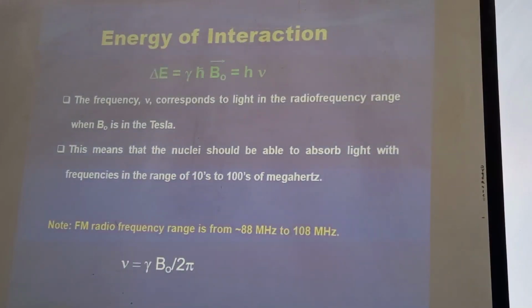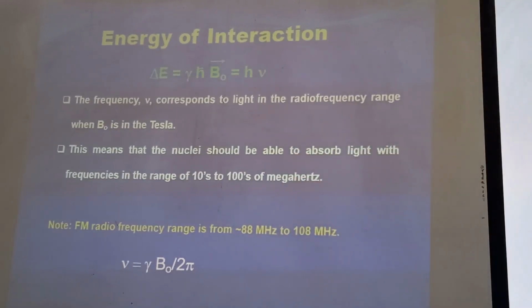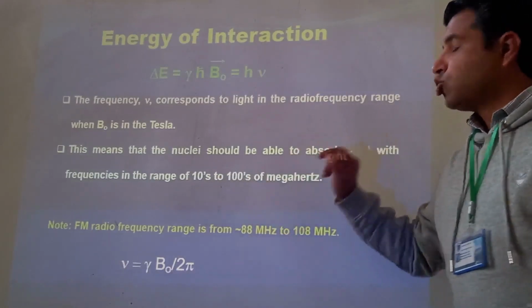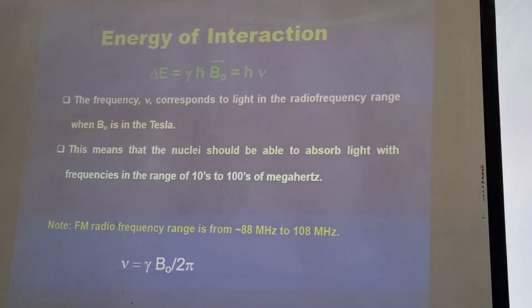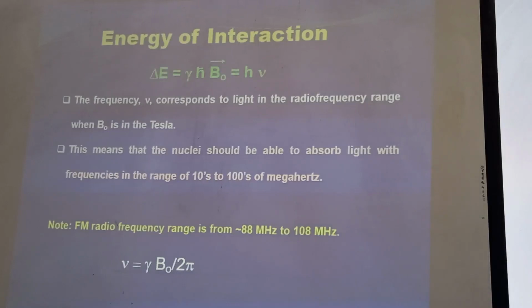So these nuclei will absorb light of a frequency in the range of tens to hundreds of megahertz.